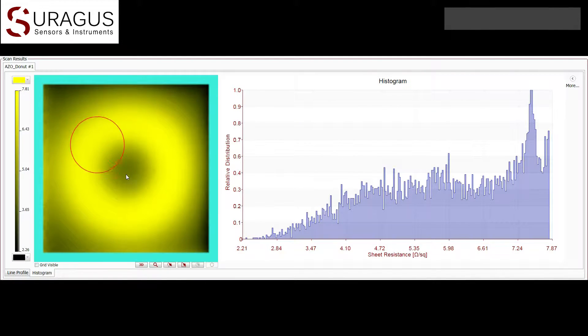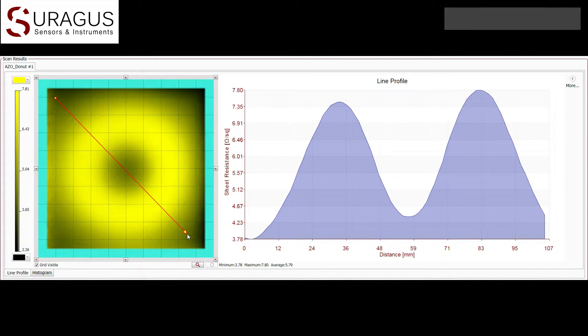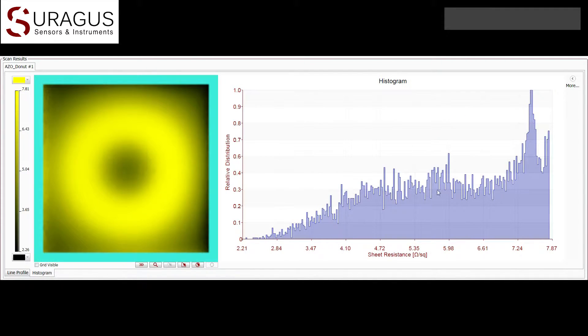Now we can comfortably analyze the entire coating as well as excerpts of the sample or line scans on our free choice. The software shows us the sheet resistance distribution, minimum, maximum and average values for any selected area. All the data will be automatically saved and available also for later analysis.